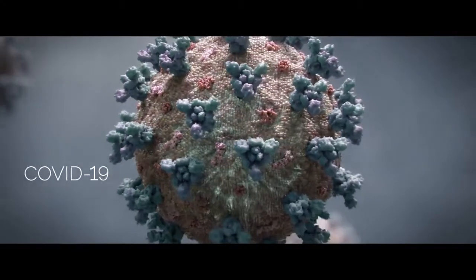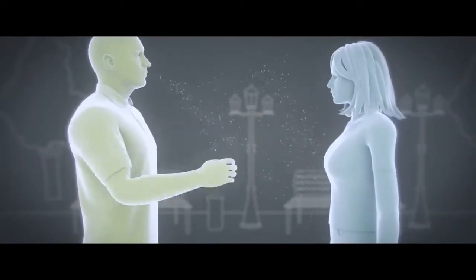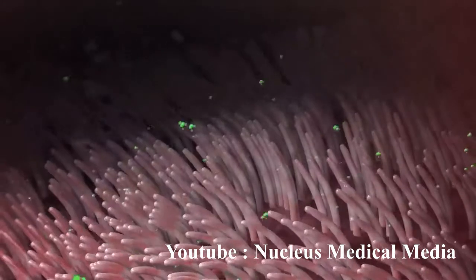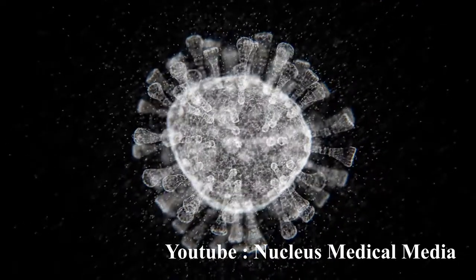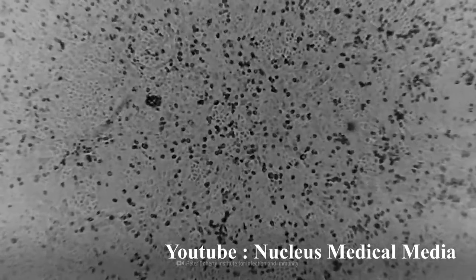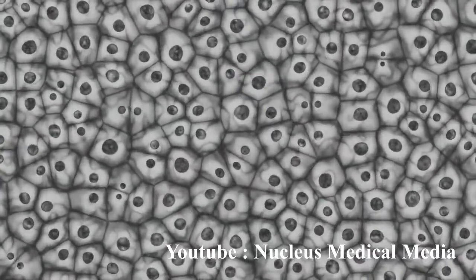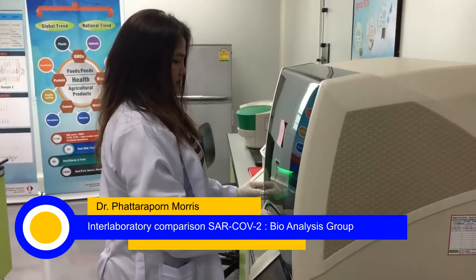Given the impact of the global SARS-CoV-2, or what we know as the COVID-19 pandemic, National Institutes of Metrology around the world have recognized the importance of standardizing the measurement of SARS-CoV-2. In a very important circumstance, the Institutes of Metrology NIM China, NIBSC and LGC UK have provided an international laboratory comparison, CCQM P199B, SARS-CoV-2 RNA copy number quantification. National Institutes of Metrology around the world have participated in these comparisons, including us, the bioanalysis group at NIMT. We participated in this comparison at the end of last year.